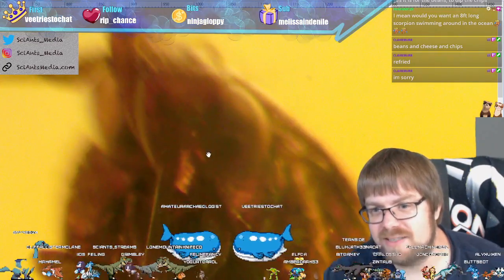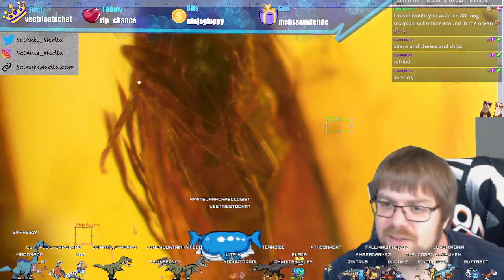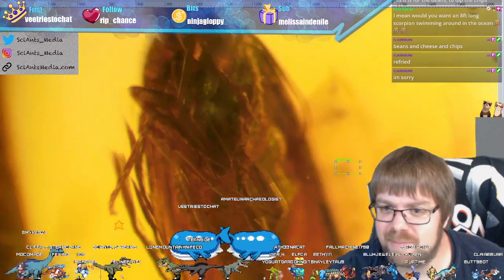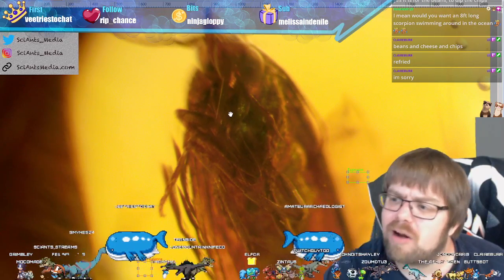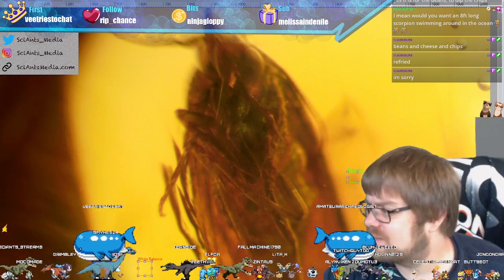There are the eyes, and there is a little curvature of the mouth, and you can see the underpart of the legs, the abdomen, the thorax here. Pretty remarkable that we can see some kind of detail like this, I think.